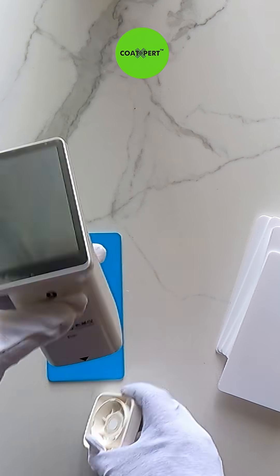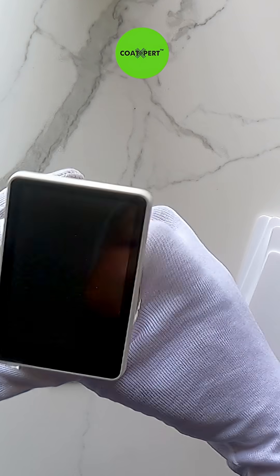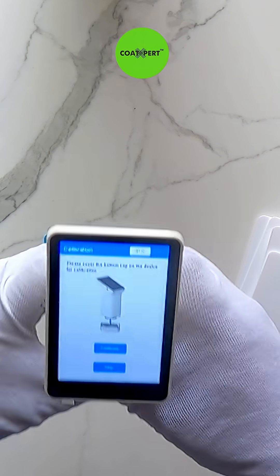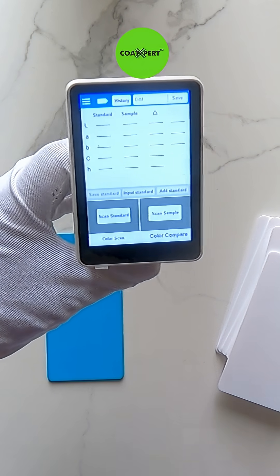With the help of the Coat Expert ABS white paint testing panel, different types of paint testing can be conducted, like paint color matching, paint gloss value checking, paint peel-off testing, paint hardness testing, and paint UV testing.